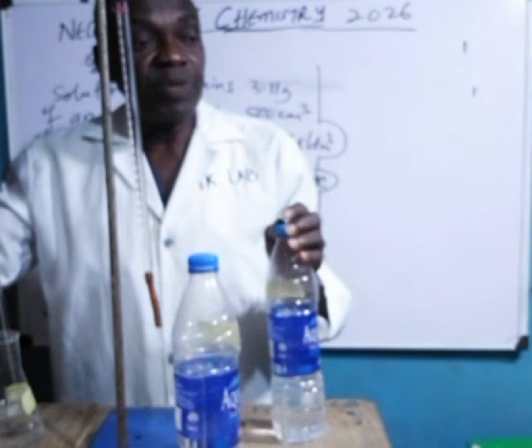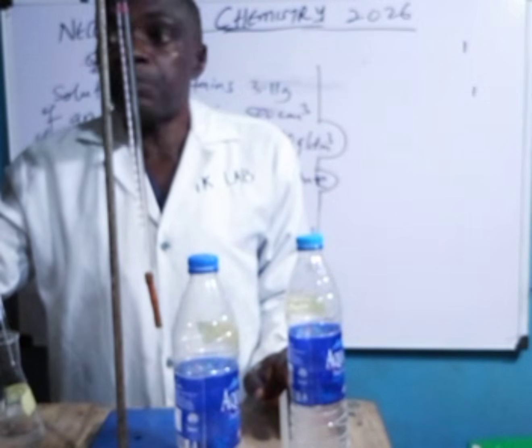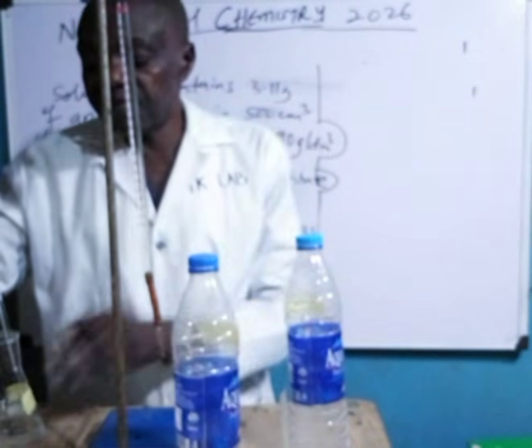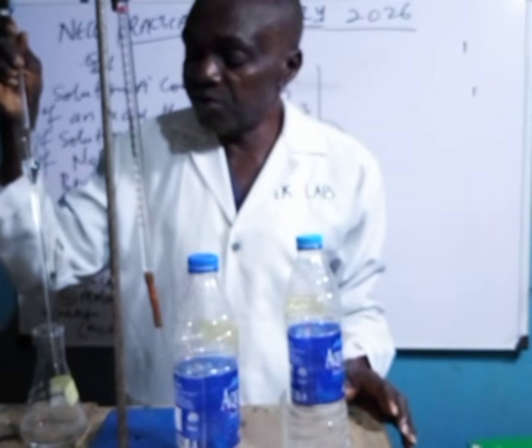Remember, this base is sodium hydroxide we are using. All pipettes have different rates of flow. So just wait patiently, let it flow. In your various pipettes, all of them will not flow at the same rate. So you wait for it to flow through. Remember, the last drop, you must not blow it off.